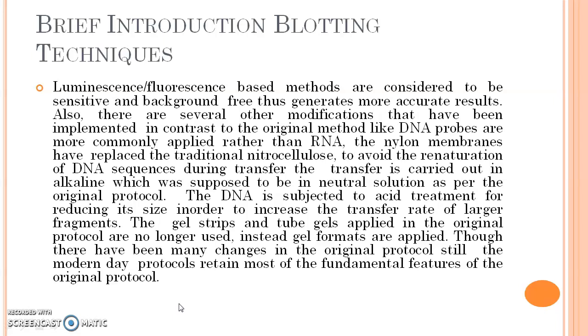The DNA is subjected to acid treatment for reducing its size in order to increase the transfer rate of larger fragments. The gel strips and tube gels applied in the original protocol are no longer used. Instead, slab gel formats are applied. Though there have been many changes in the original protocol, the modern day protocol still retains most of the fundamental features of the original protocol.